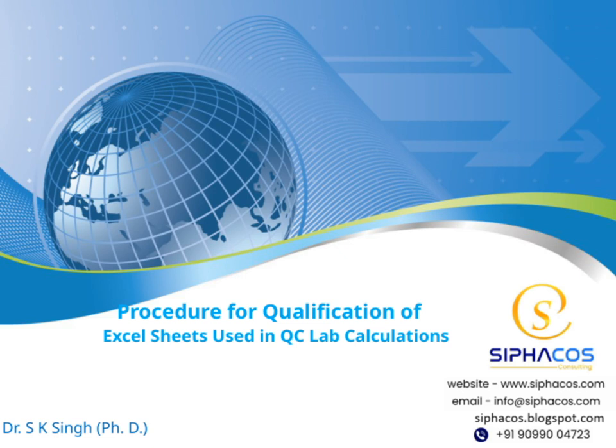Today, we will be discussing a very important topic, the procedure for qualification of Excel sheets used in QC lab calculations. This presentation will walk you through the necessary steps to ensure these sheets are reliable and compliant. We'll cover the key aspects of validation, documentation, and best practices to make your QC processes robust. Let's get started and make this session informative and engaging.